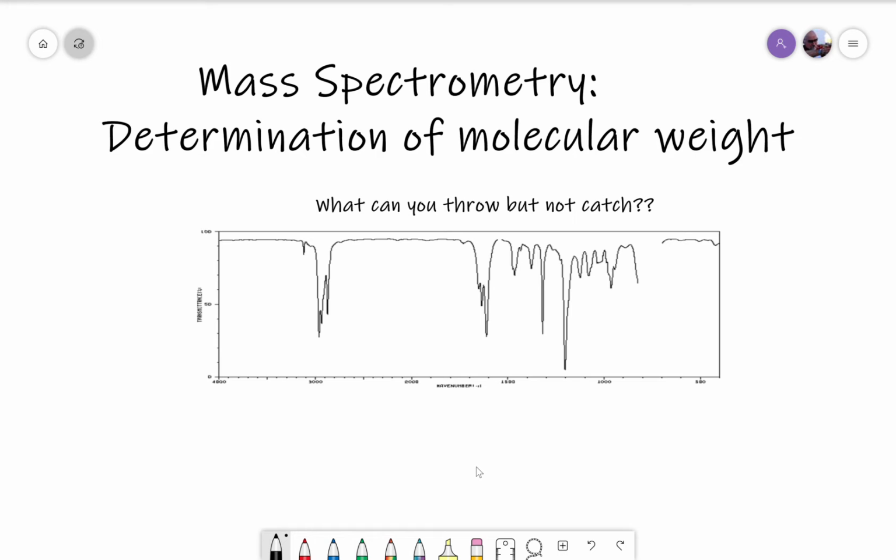Okay, let's revisit the determination of a structure of an unknown compound using an IR spectrum. Normally when we're given an IR spectrum, we can make certain assessments about its structural characteristics. And in previous problems, we had determined likely Lewis structures, or the structure of the molecule, given an IR spectrum. But that always gave us additional information.